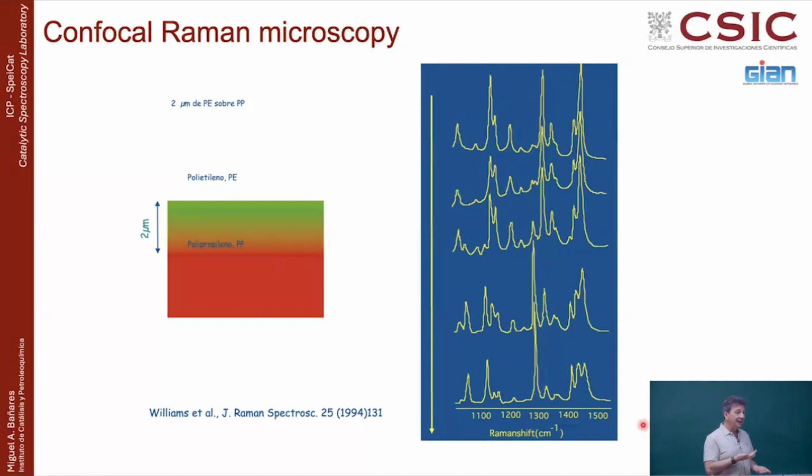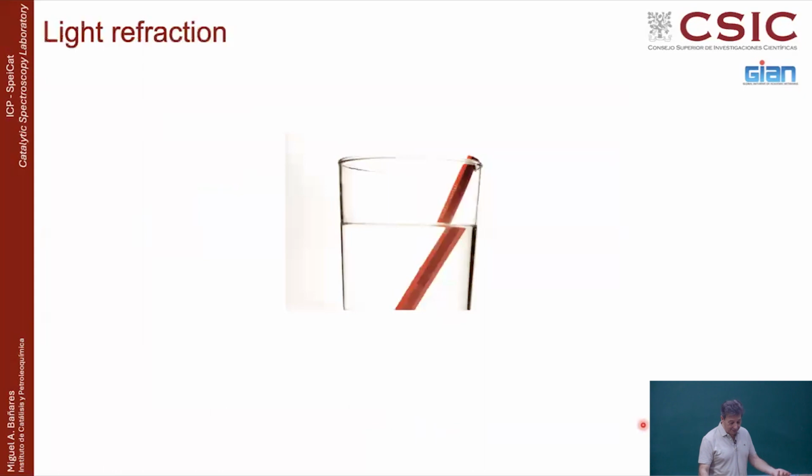And that means that less photons go to you. So you are much more accurate in space, indeed. You get rid of things which are above and below the focal point, certainly. But the total number of photons that get to you is lower. So the intensity of the signal is lower, so you get a weaker Raman signal. But, I mean, that's part of the deal. You trade off something and you're trading another thing.